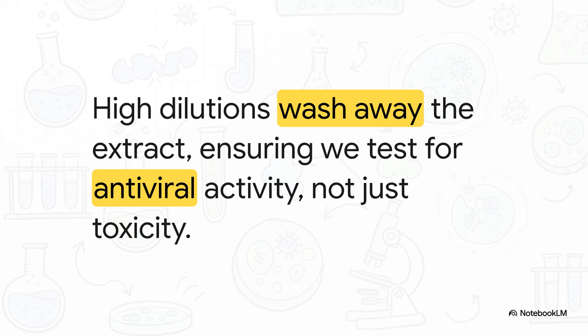Now listen up, because this next step is so important if you want a result you can trust. We do a bunch of high dilutions. Why? Well, it's pretty simple. What if our extract is just plain toxic to the cells? We have to wash it away so that if the cells die later, we know for sure it was the virus that did it, not our hero extract. This makes sure we're testing for antiviral power, not just general toxicity.